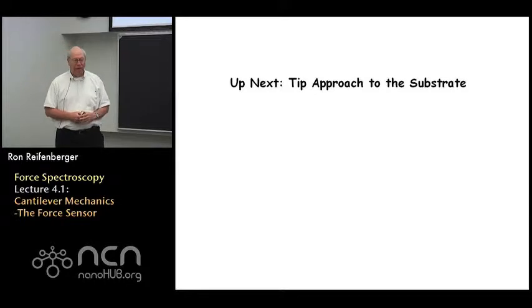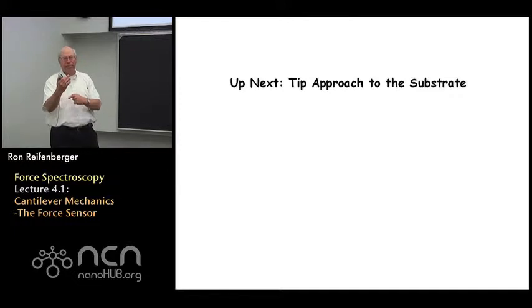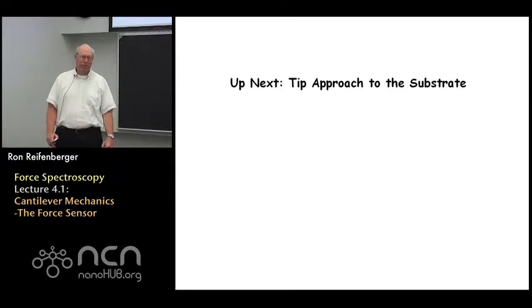And I'll just say that our next topic is going to now move more into the analysis of data. We're going to start to talk about how the tip approaches the substrate and try to systematically work our way through the physics of that so that we can properly interpret that data to get information about the tip substrate interaction force, which is where all the interesting physics and chemistry lies.